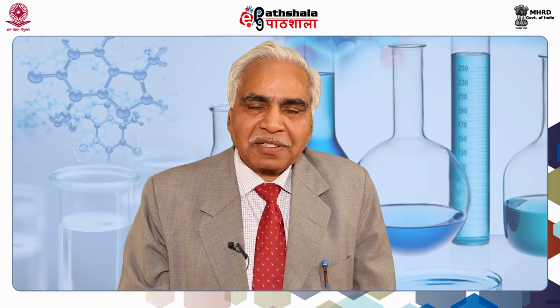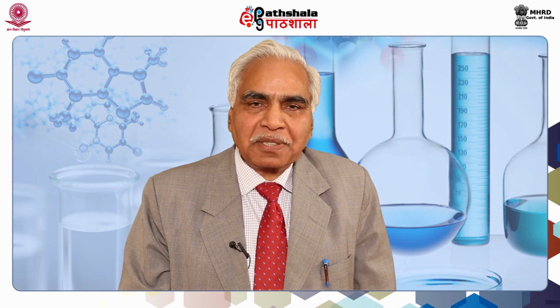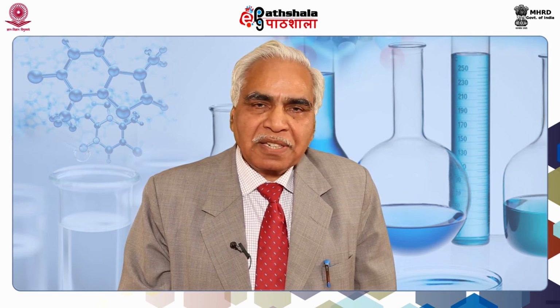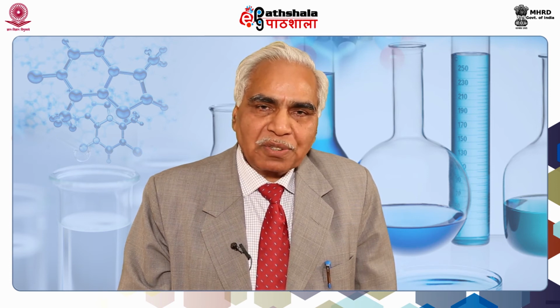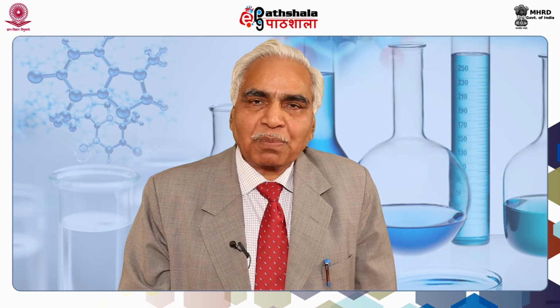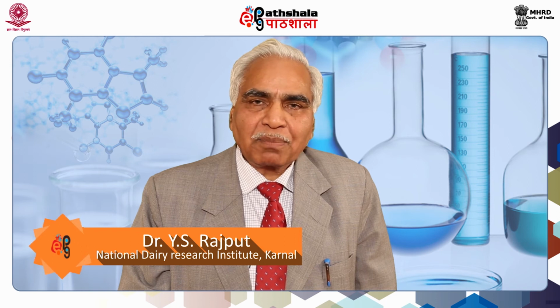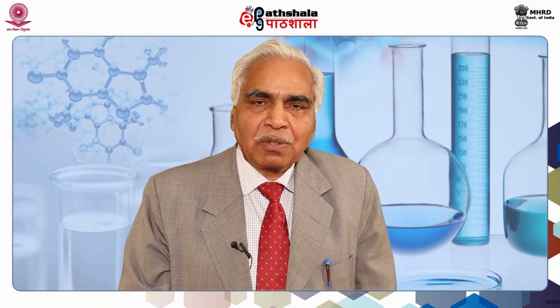So far I have covered the scientific principles only, but my efforts in the subsequent presentation will be on how the sample is injected. It has a specific device for injection of sample which is different from the other electrophoretic techniques. We will see how a molecule can run through the capillary and get detected. We will also discuss the detection systems available at the capillary end and how the data can be processed through a data processor so that the final results come in the form of a plot where peaks are plotted against the retention time. This will finally help in identification of unknown molecules separated on the capillary gel electrophoresis.